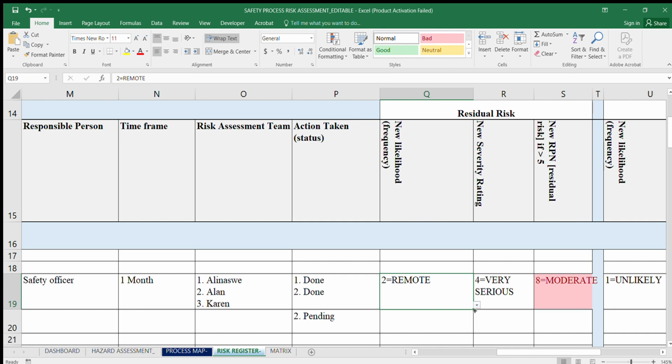It means that at this point, the chances have increased, and the risk has increased, because the likelihood of this particular risk happening has increased, as this risk has happened before.